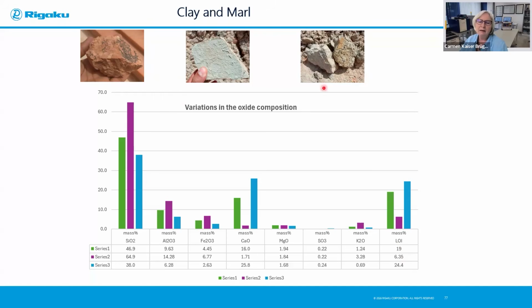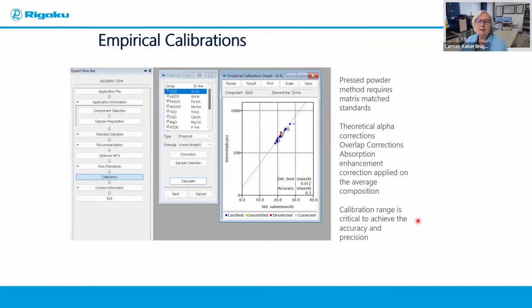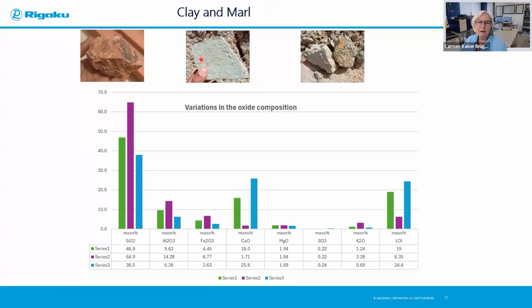Of course, many of the mining laboratories do not have the luxury of having an XRD. So then we are stuck with XRF, but we're really not stuck, because we have colors and we have composition and we have spectra. But in our software, we also have the very nice idea that we can not only prepare empirical calibrations, because what did we say? Empirical calibrations need to have matrix matched calibrations. So that means these different materials require different calibrations because of the matrix.